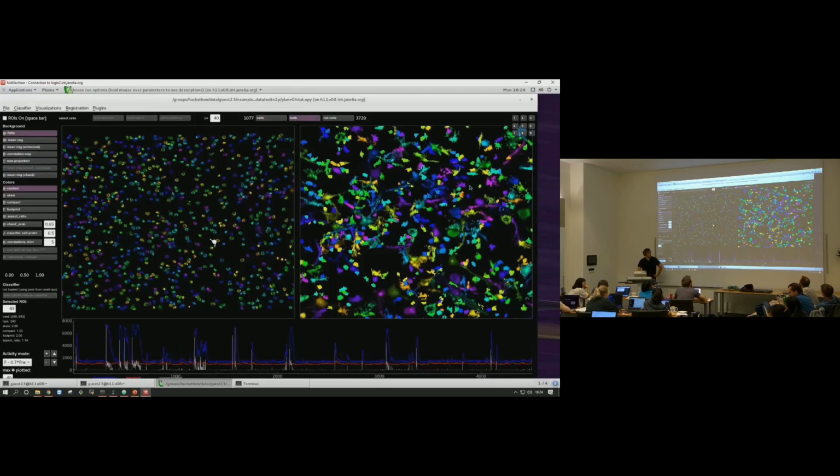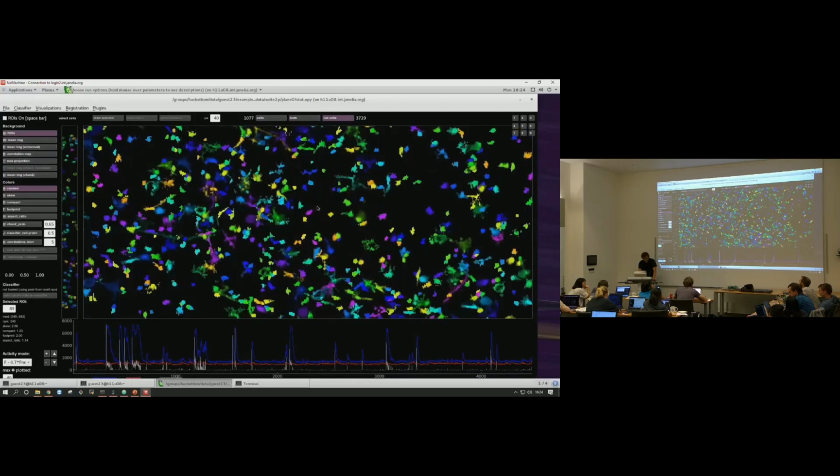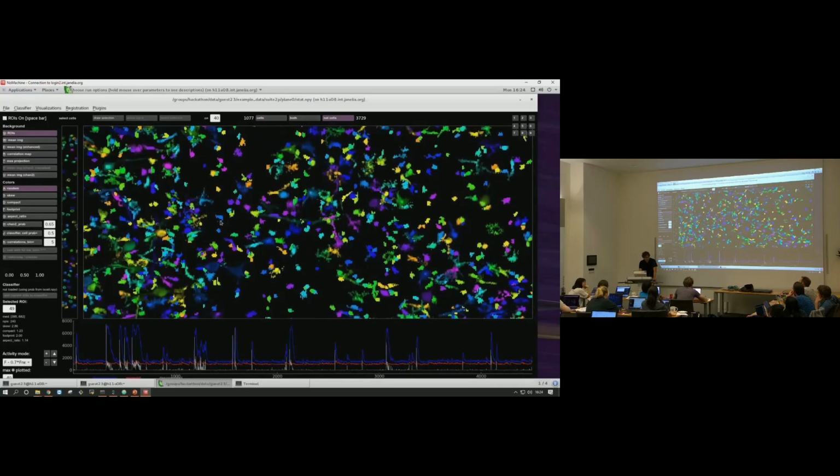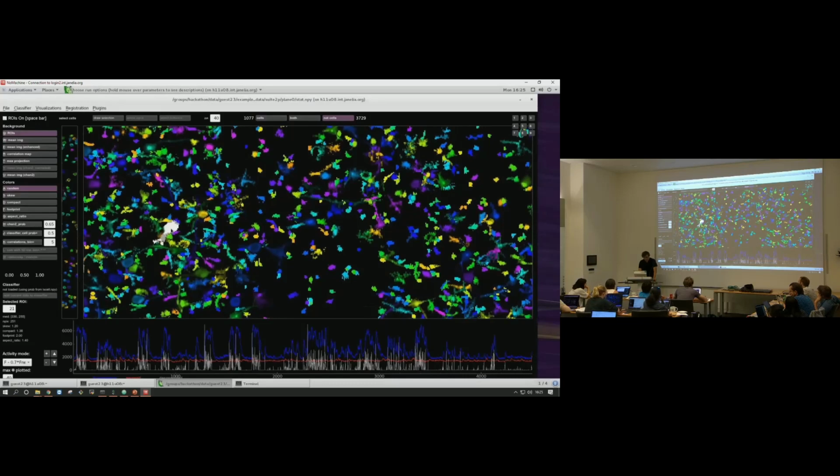If you get an ROI that clearly looks like a cell, but if you look at the activity trace, it's pretty much the same as neuropil, do you intentionally ignore that because you don't want to include cells that have bad signal in your analysis? Or do you include it because you want the classifier to find the right cells? Yeah, that's a good question. Actually, that shouldn't happen too often because everything that makes it up to here usually has activity distinct from the background, from the surround. It might be small activity. It might be literally one transient over an entire trace. And so yeah, I would take it in that case. It shouldn't happen too often at this stage.